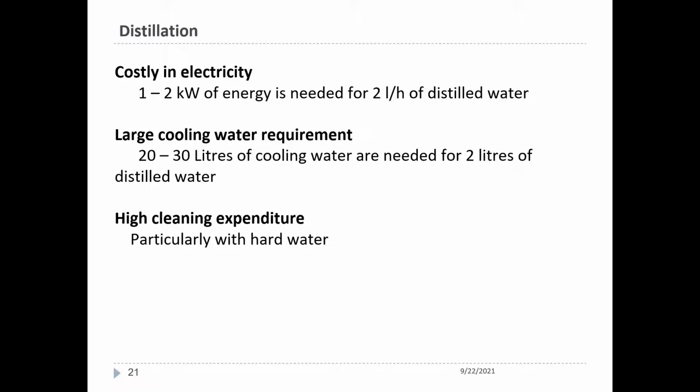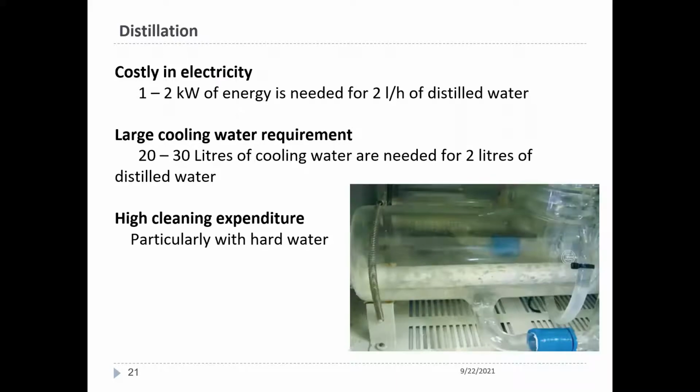So we can imagine the amount of water that goes to the drain just to produce a small volume of water. And there's a lot of challenge if you have hard water, because then you would have your distillation plant looking like this, and no one in the lab wants to clean this. You will require acids to clean them. And then it makes the glass very slippery and could easily break or cause injury to the person cleaning.